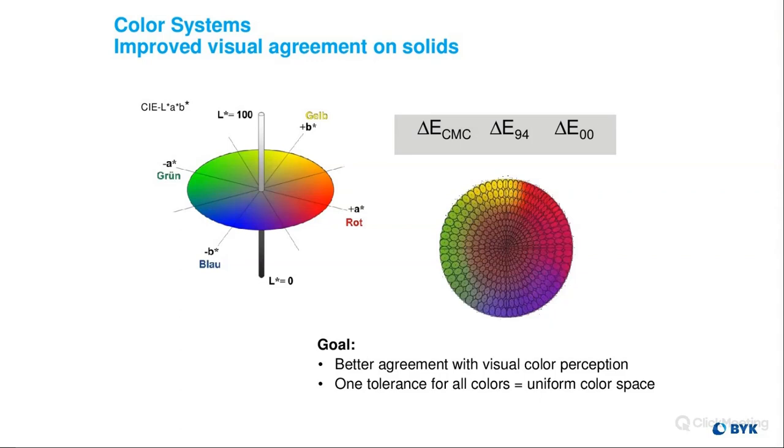Okay. What's interesting is there's no way to predict when it will change, but there is some technology out there that can predict how it's going to change, so what it's going to look like when it has zero fluorescence. Let me just get this right. If you have something with fluorescence, there's technology that will anticipate what it'll look like as it loses that fluorescence all the way down to zero fluorescence.